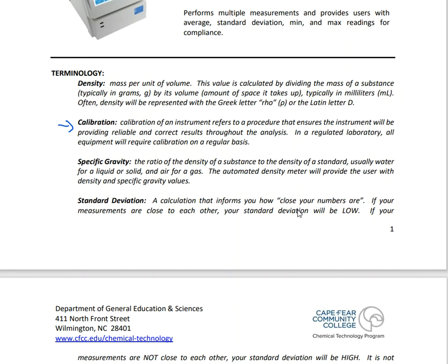And this is a concept that our instrumentation, all right, we've got some instrumentation in the lab. There's tons of it, actually, right? We have over $1 million worth of instrumentation in our lab facility. And this instrumentation has to be calibrated, which basically means you have to ensure that it works.